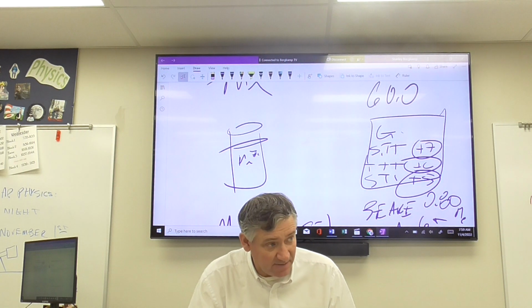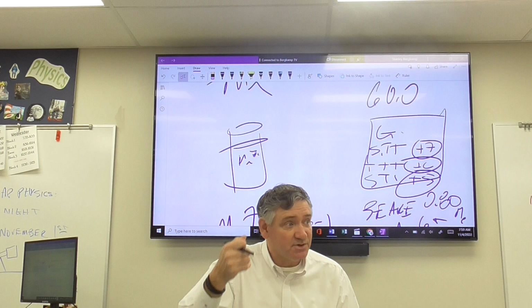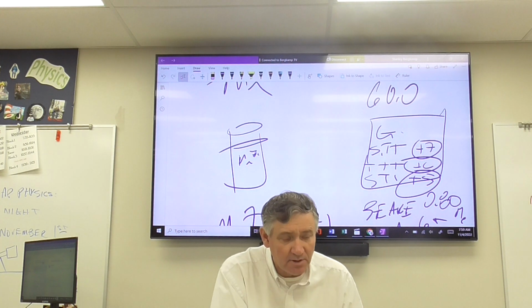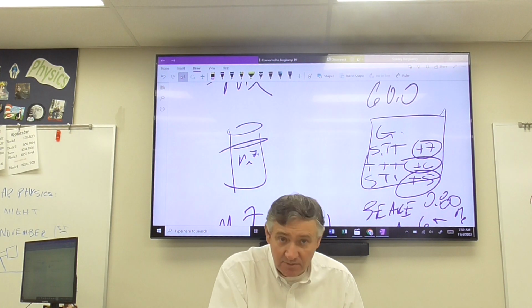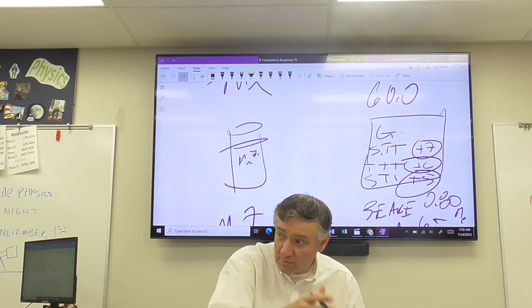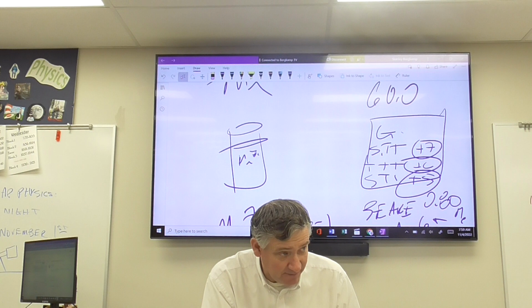And as you're counting these drops, you're going to add a drop, stir it. If you're using that stirring rod, make sure you wash that stirring rod in between different solutions, okay? Otherwise, you're going to cross-contaminate this thing, and it's going to be an absolute train wreck, okay?